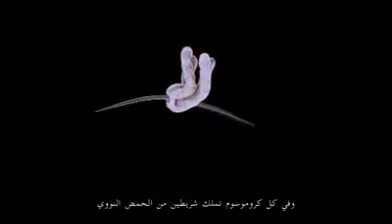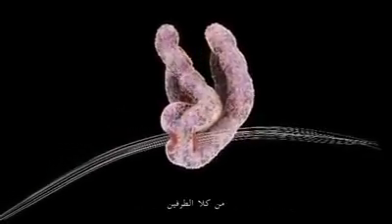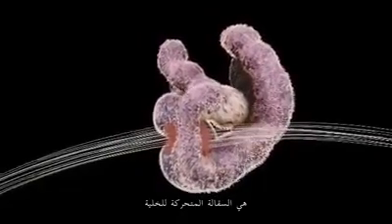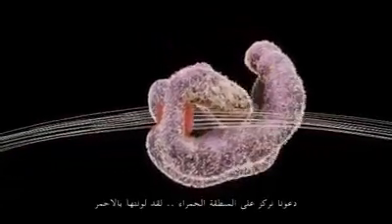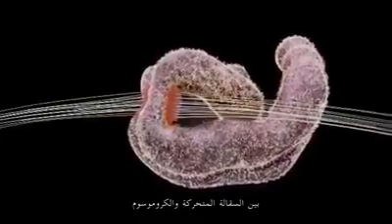So this is a single chromosome, and you have two strands of DNA in each chromosome. One is bundled up into one sausage, the other strand is bundled up into the other sausage. These things that look like whiskers that are sticking out from either side are the dynamic scaffolding of the cell. They're called microtubules, but the name's not so important. But what we're going to focus on is this red region. I've labeled it red here, and it's the interface between the dynamic scaffolding and the chromosomes.